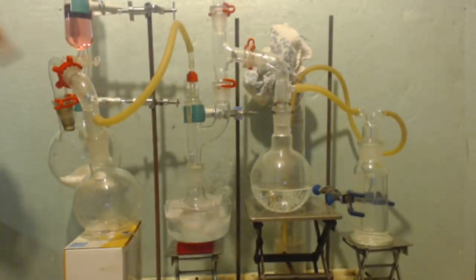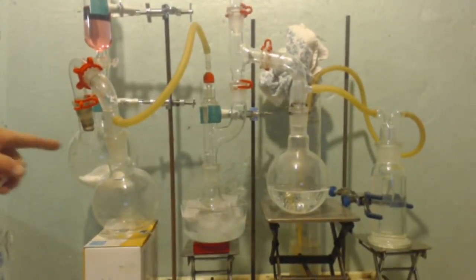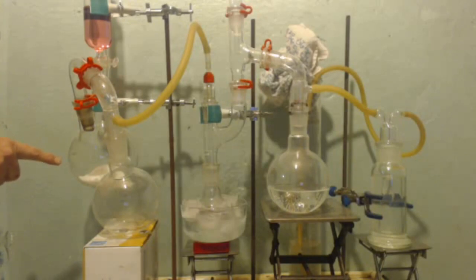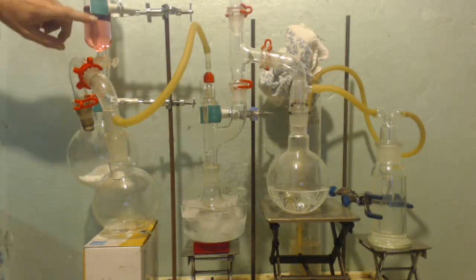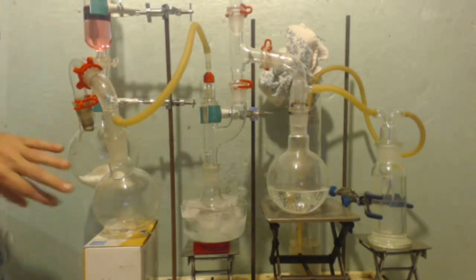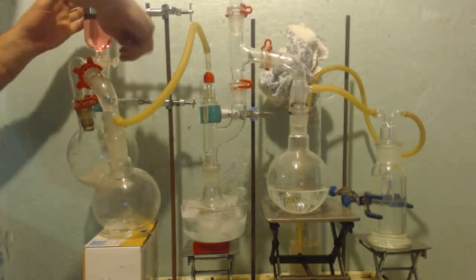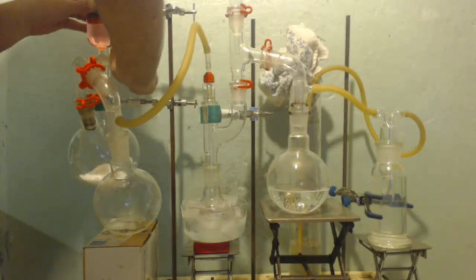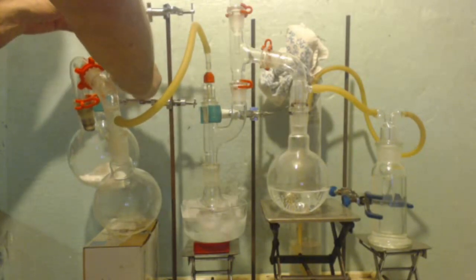Add 100 milliliters of sulfuric acid. I didn't do anything to it to clean it up. And I put 114 grams of table salt plus another 37 grams, because I figure if I don't have enough, it's easier to add this sulfuric acid. And if I have a little bit in here, I can heat it up or whatever. So here I'm going to start it up. Just want it to drip.